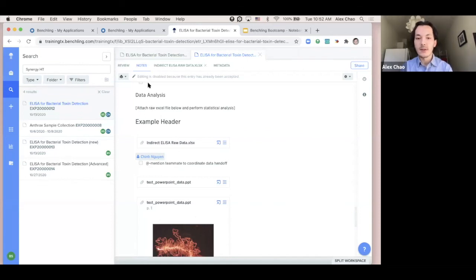And as you can see here, we do have a spread of different responses to this poll. We can see 52% of folks felt like this was sort of difficult. So essentially searching for specific notes was sort of difficult. And there was certainly a range. Some folks have found this very difficult as well. So again, want to call out that utilizing global search, you're able to search for not only notebook entries, but again, any of the data that you have on Benchling, whether that is DNA sequences, or if your team utilizes the registry, you're also able to search for registry entities as well. So again, highly recommend utilizing global search, in lieu of utilizing a complex folder or project structure.